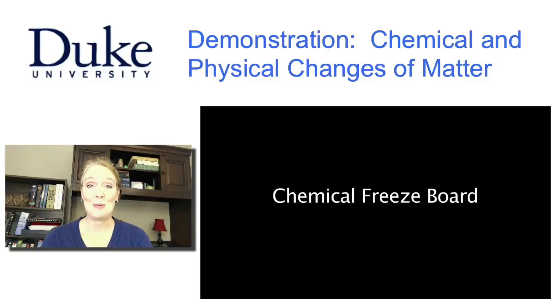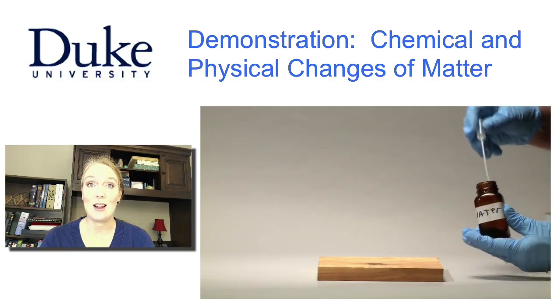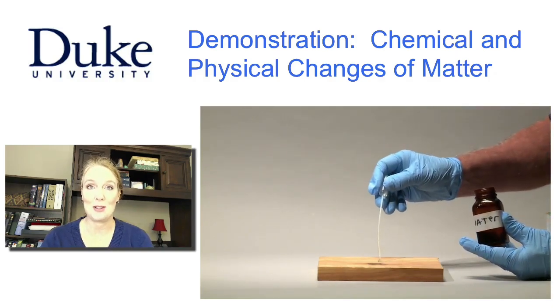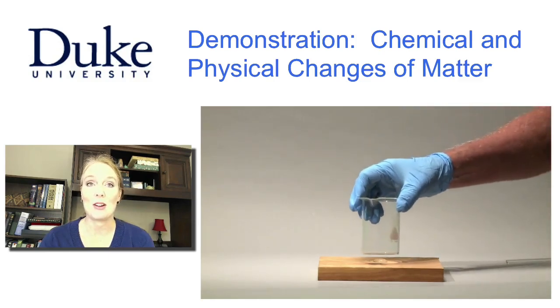In this video, we'll observe some chemical changes of matter. In fact, we are going to use chemistry to cause this wooden board to levitate. First, Dr. Lyle will add a small puddle of water to the board. Next, he's setting the ordinary empty beaker on the puddle.